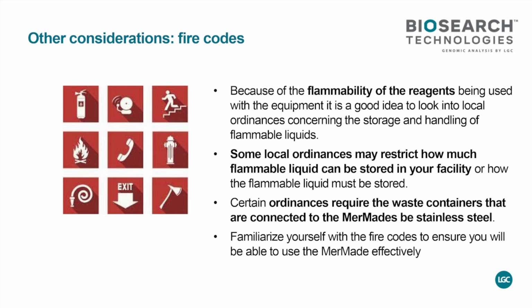It actually goes like this, the higher in the building you go, the lower it gets. So if on the bottom you're allowed a 20-liter container of flammable liquids, when you get to like the fourth floor, it's only 200 milliliters. And make sure that you have all that information before bringing the instrument in, because it does use a certain amount of solvent and generates a certain amount of waste.